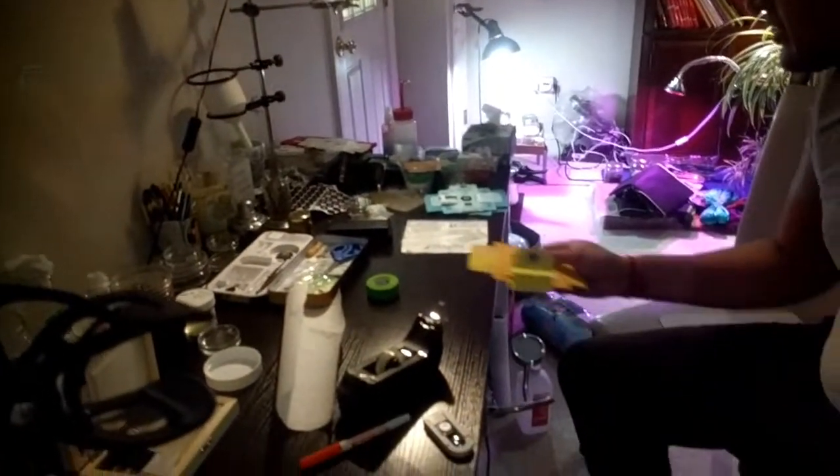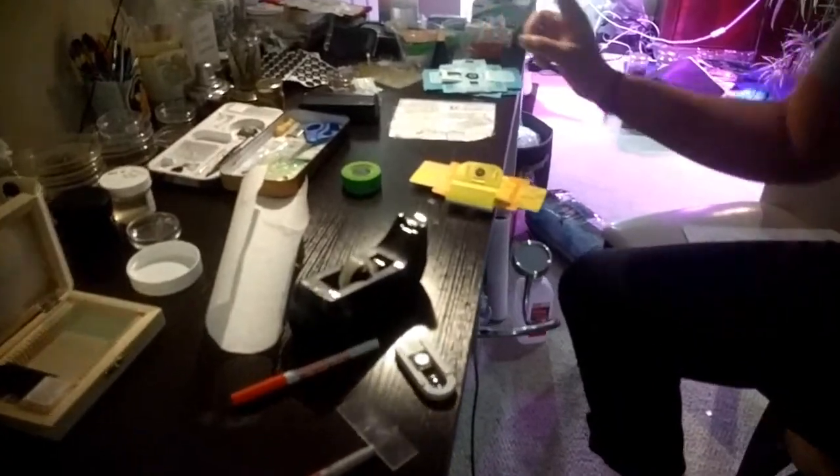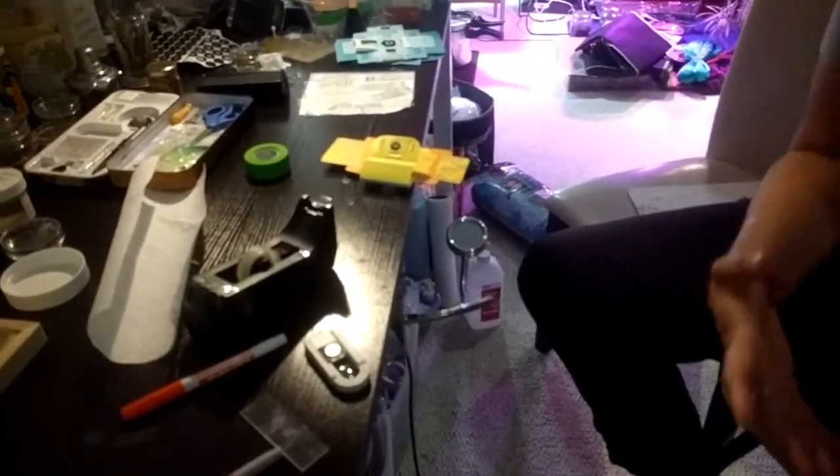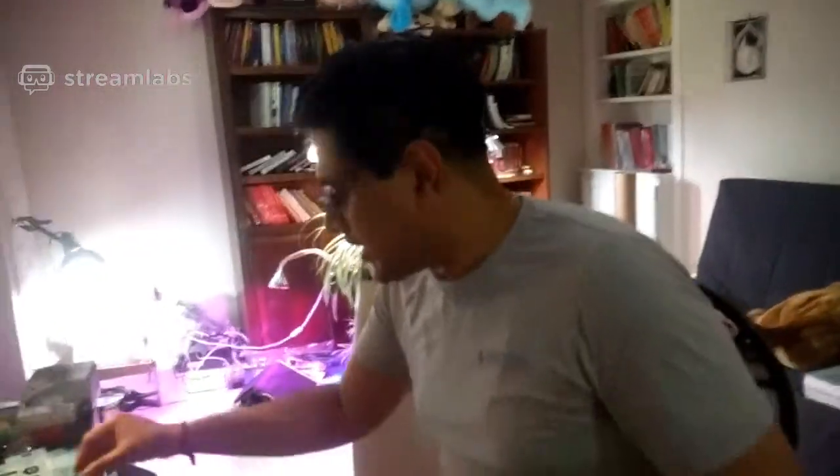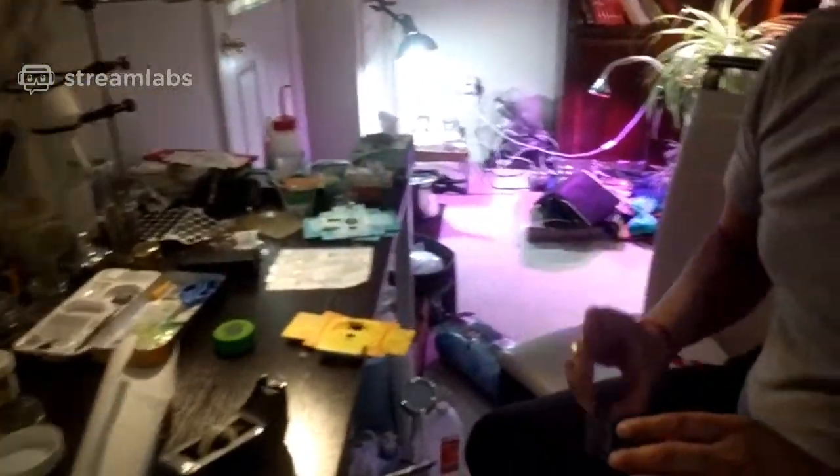All right, so now let's get this moving. I have a mix of things today. The first thing is that I want to show you all some things that I've prepared. Since I have a lot of life forms and it takes a little bit of time, I have some things that I've prepared for you all, and I have some things that I will prepare to show you how things are done. All right, so now let's begin with bacteria.